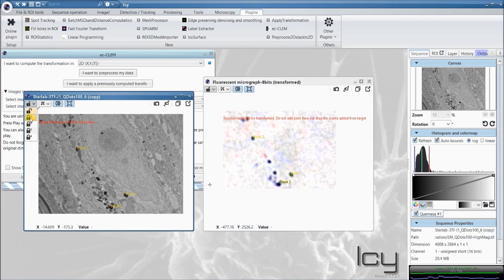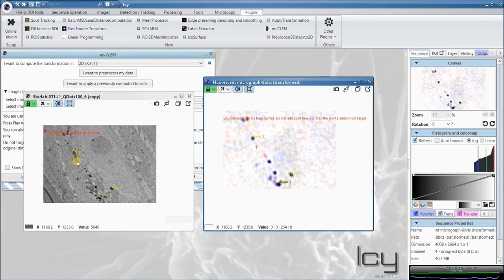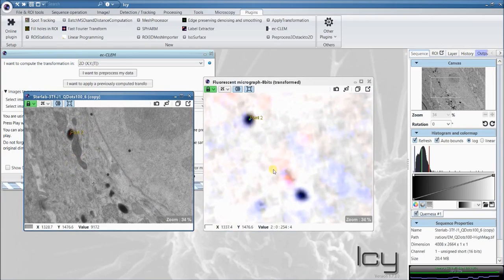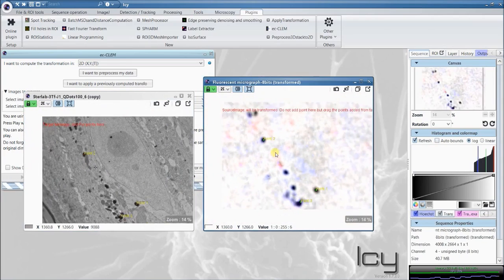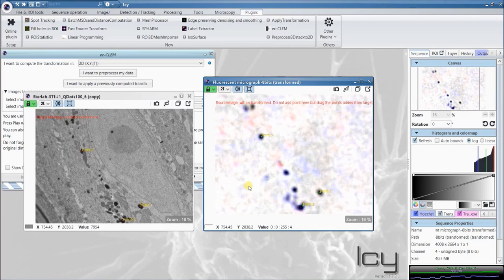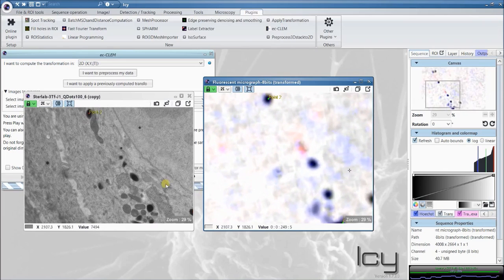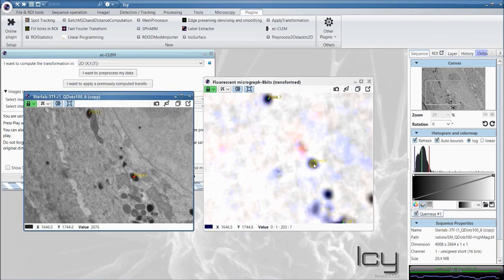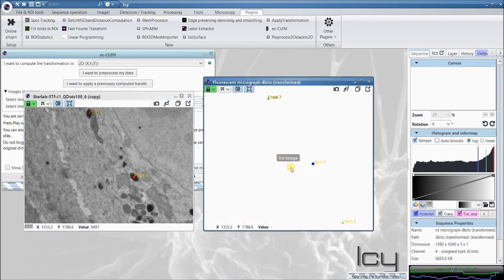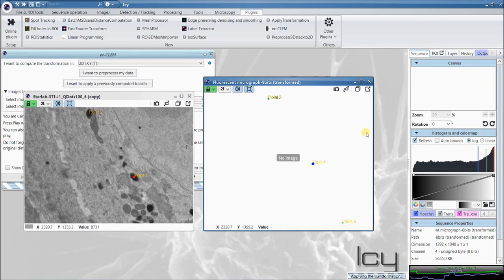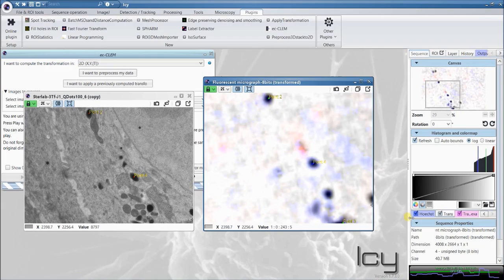then what you can see already is that our melanosomes look pretty much the same way as those ones. If you lock the two images together, when you zoom in, it zooms in the other one and vice versa. So you can add more points on the target image. And you see it's already pre-aligned properly. You have to adjust it because it has no prior knowledge of where points should be. That's up to you to adjust it.